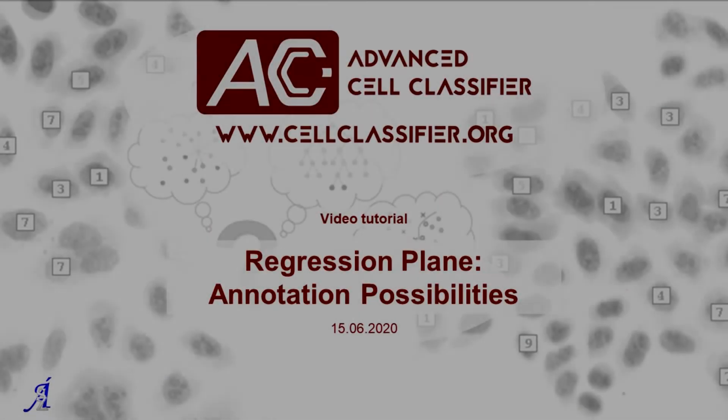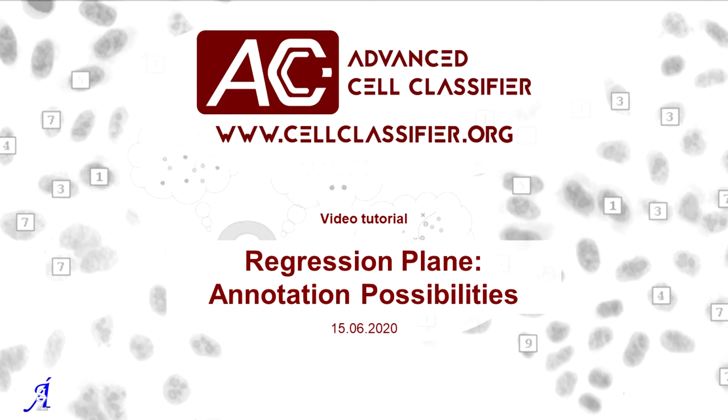Welcome! In this video tutorial, I will briefly show you how to annotate cellular processes in Advanced Cell Classifier using its new module, the Regression Plane. Regression Plane provides continuous two-dimensional space instead of the traditional discrete phenotypic classification. The continuous annotation interface is especially useful if the cells in your experiment show transient phenotypic properties, or if you are investigating continuous biological processes.